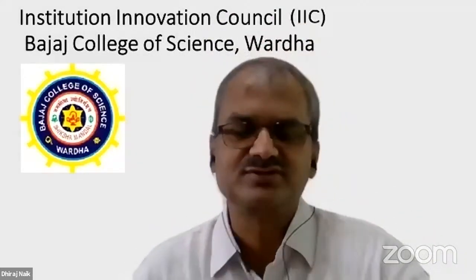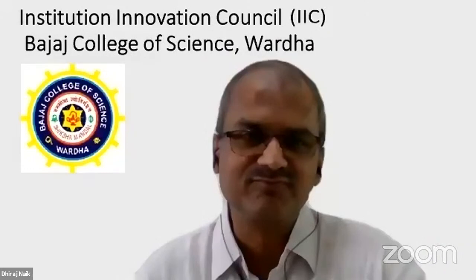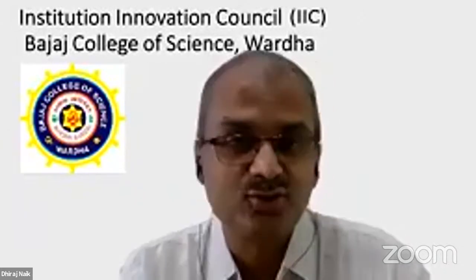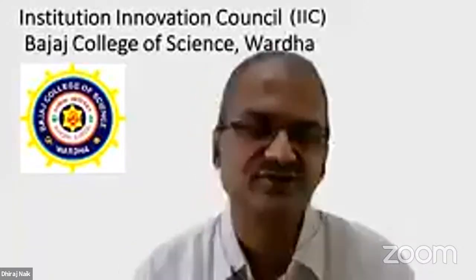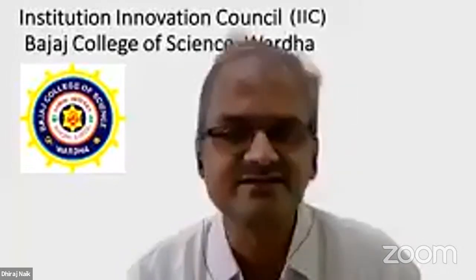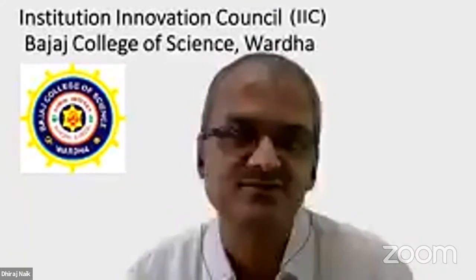Thank you, Dr. Jim. It was a wonderful discussion and we really enjoyed your overall presentation as well as your thought process behind Foldscope and how you are implementing this at the worldwide level. In this post-pandemic time, there were so many restrictions on academic institutions on how to teach the practical aspect of biology, how to show things with the help of a microscope. A typical microscope, although portable, cannot be carried by every student from the lab to their residence. Therefore, it was very difficult to teach or observe biological specimens at an undergraduate level.